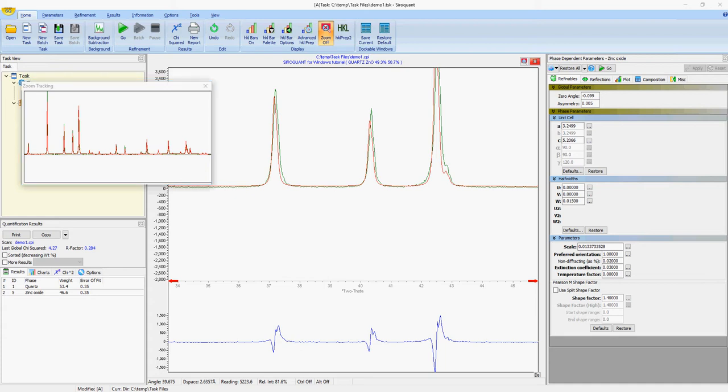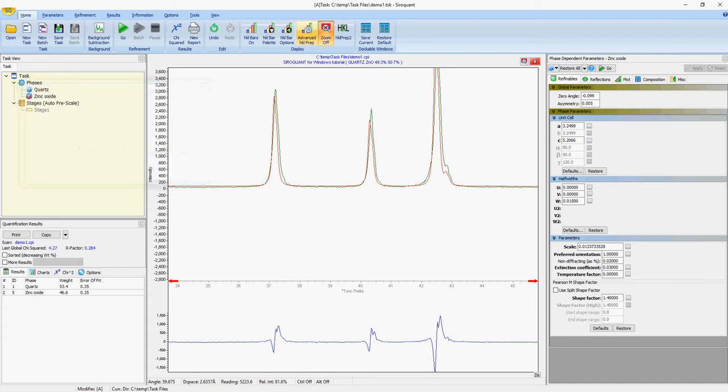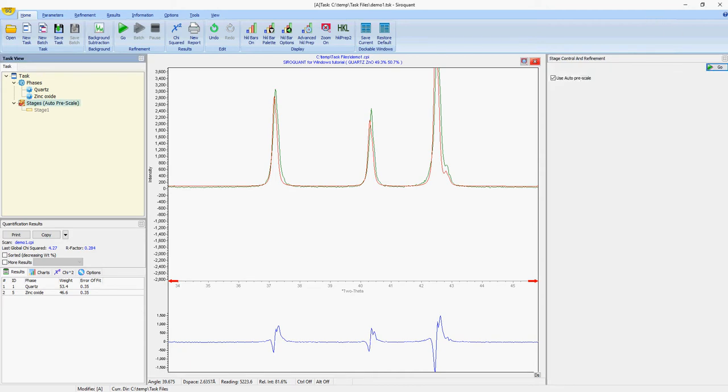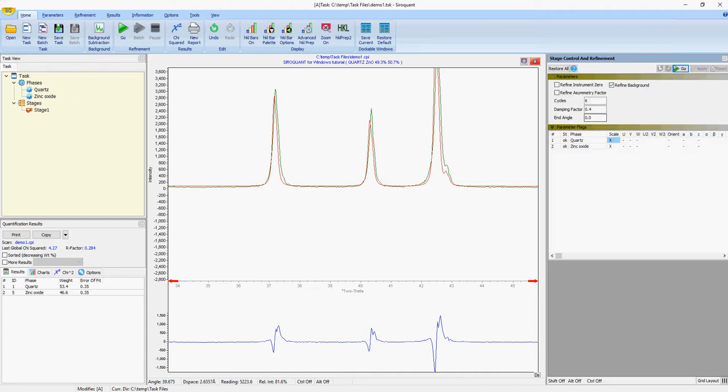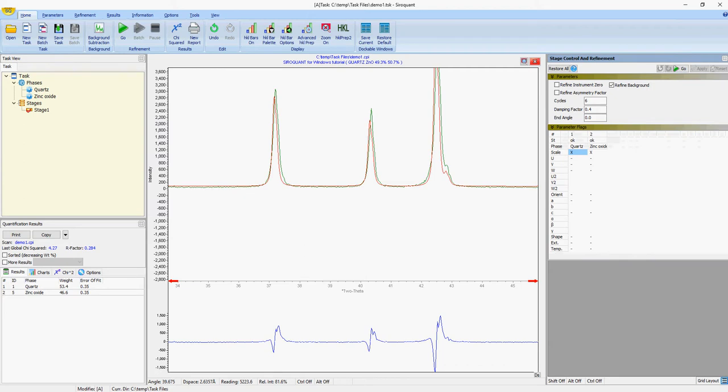A couple of other points to note: when you want to start refining the individual parameters of each phase, you click on the stages box and unclick the auto prescale, and this will show you the different refinable parameters for each of the phases. Another neat little trick is that by clicking this grid layout button, you can change from a vertical to horizontal orientation, so depending on how many phases are in your scan or how you've got your monitor set up, you may want it vertical or horizontal.